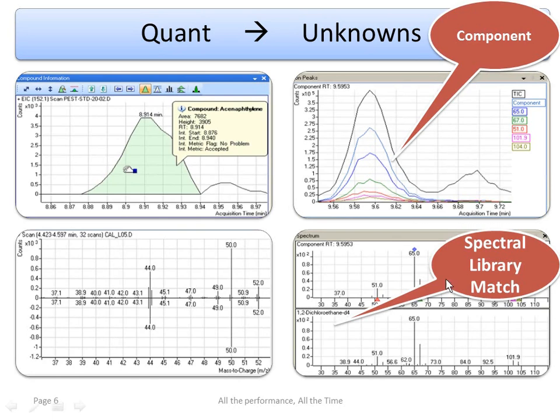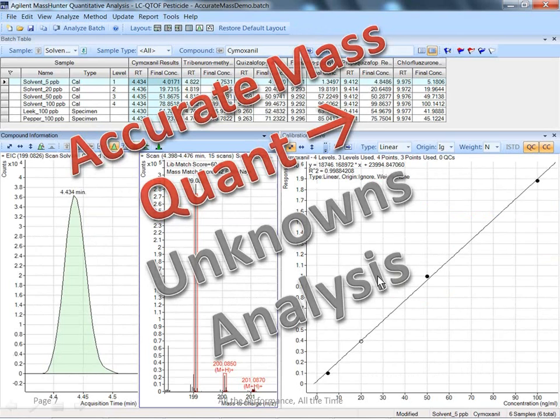As you can see here, we have a library of spectra that we've collected, and it's going to match up against that spectra, giving you a library match score. So that's an important distinction between extraction of ions and then deconvolution and library searching.